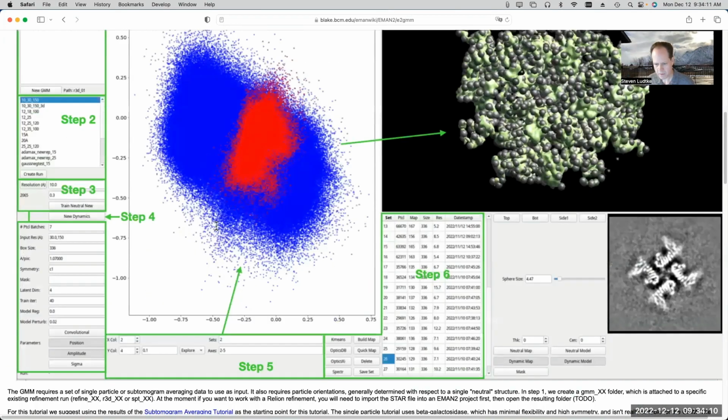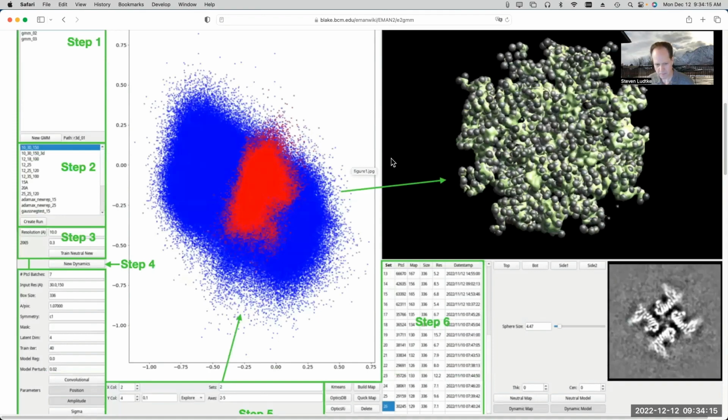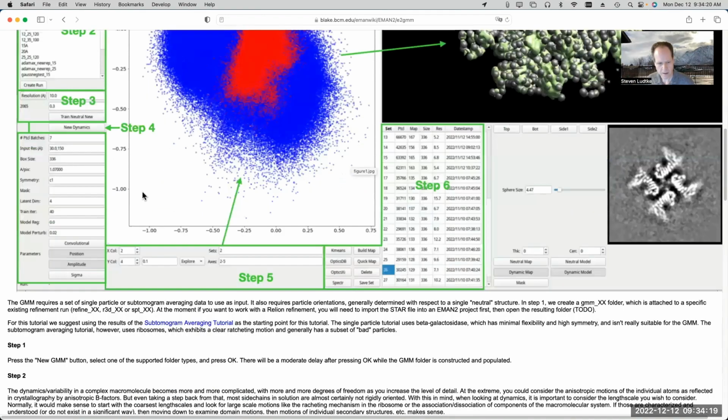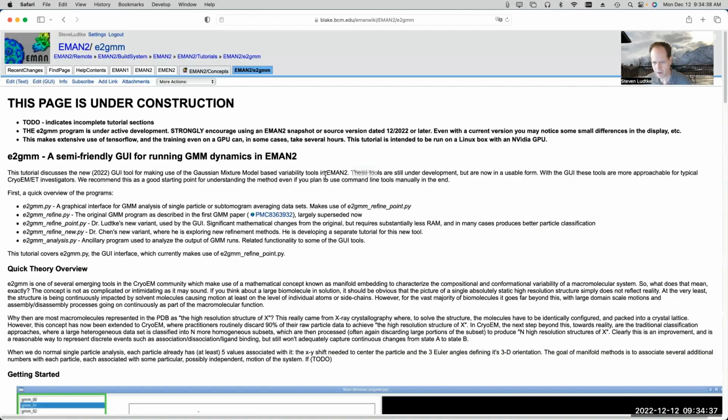So you can see that it's got some examples with the graphical interface here. Some of the stuff that you see in the GUI has already changed a little bit. So when I took this screenshot, this button existed and this button existed. Those are gone now. Anyway, there's been a couple of other subtle rearrangements, but everything is more or less in the same place that you see it here.